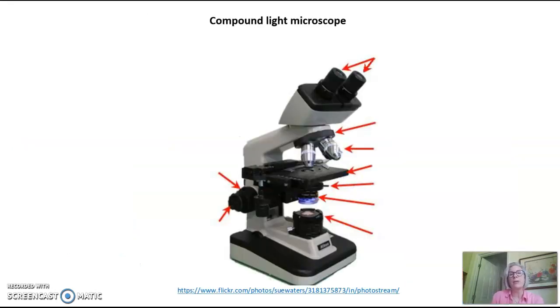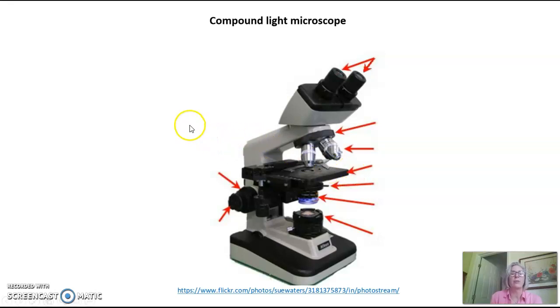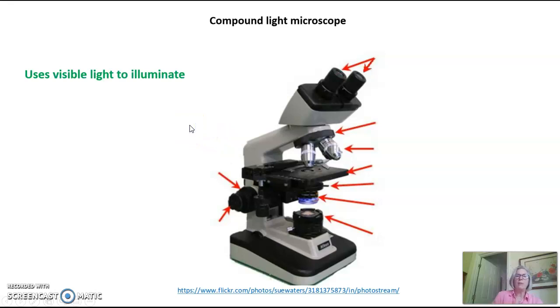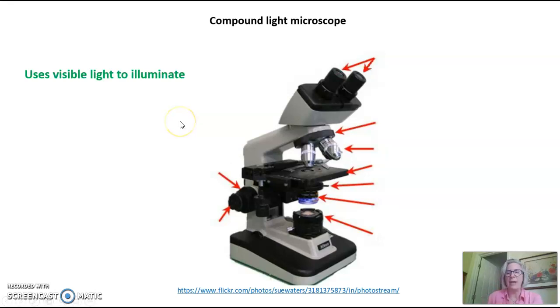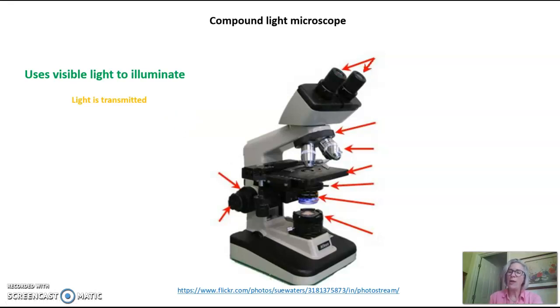Let's start with the compound light microscope pictured here. We will be using these extensively in the classroom. The compound light microscope uses visible light to illuminate its specimen, and the light is transmitted — meaning the light goes all the way through the specimen.